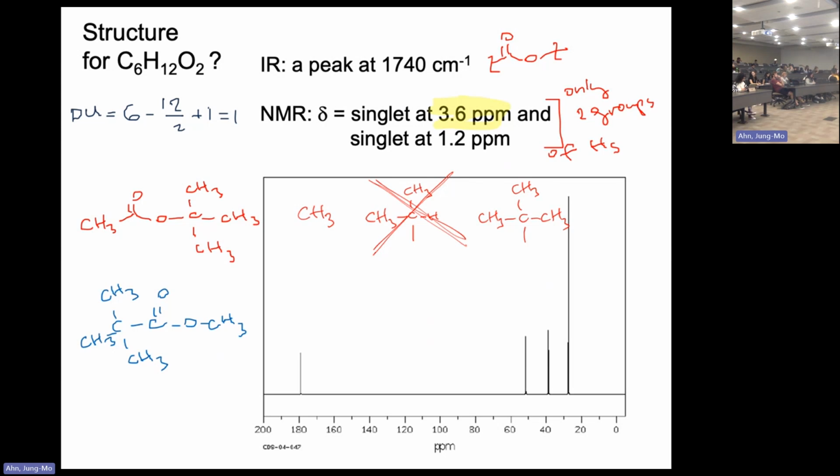So it's going to be like a 1.5, and this one will show up in the 2.45 region. On the other hand, if it's connected this way, with the methyl on the oxygen, then that's the one giving the 3.6 signal, and that one can still be 1.2. So that's the reason why you should pick this one as the answer, not the other.